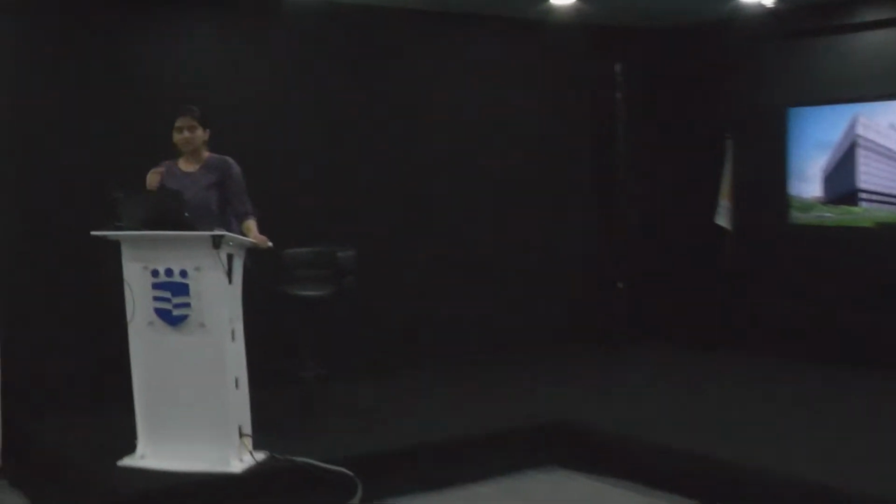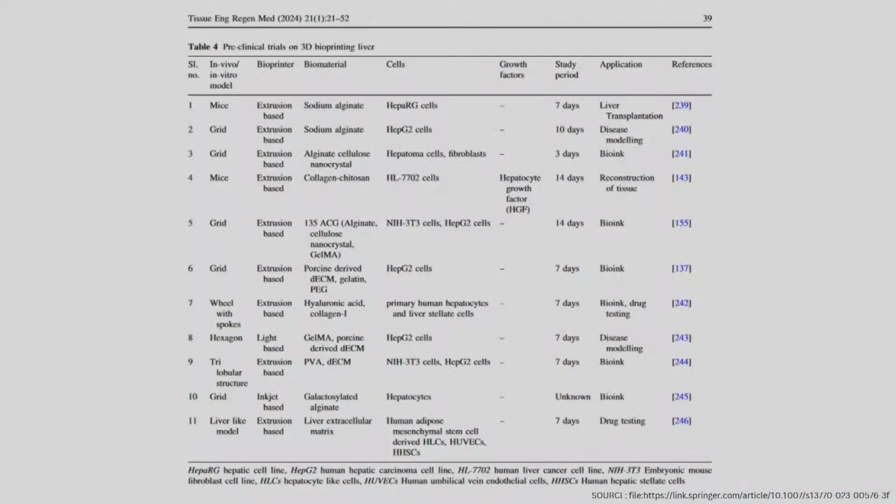Now, this machine that you're seeing is the Trivima Advanced machine. This is the medium range of machine. In the next version of the machine, we have the inkjet module already attached to it. So what happens there is the piezoelectric element will be attached to the extruder head inside, and as and when you give an electric impulse to the piezoelectric element, it will create a differential pressure inside the chamber.